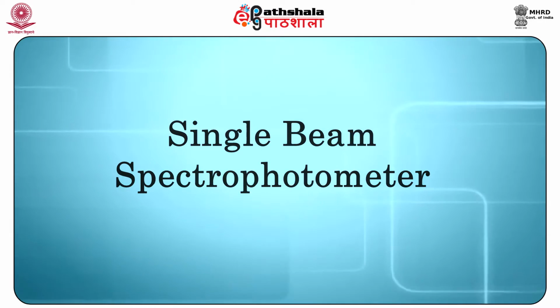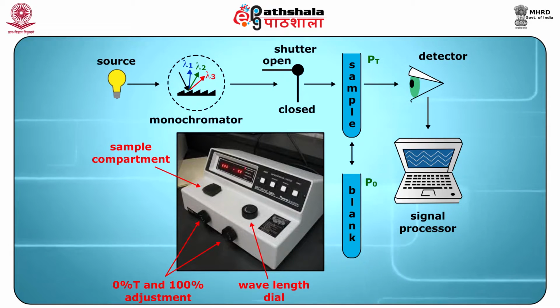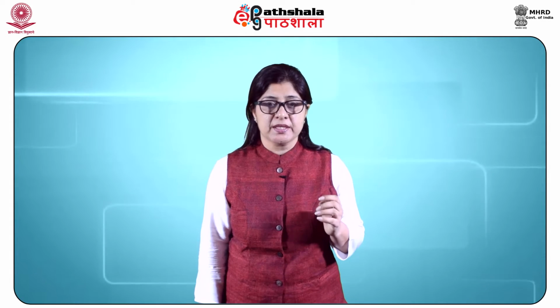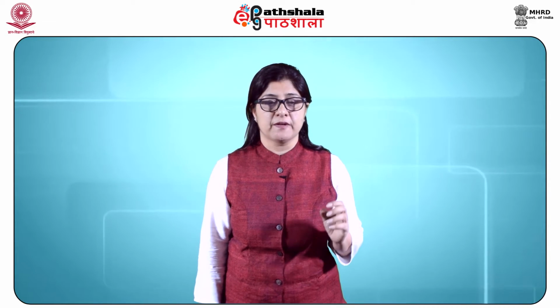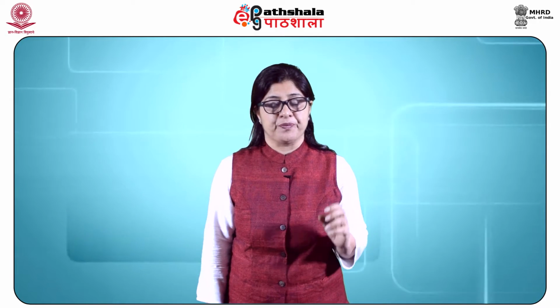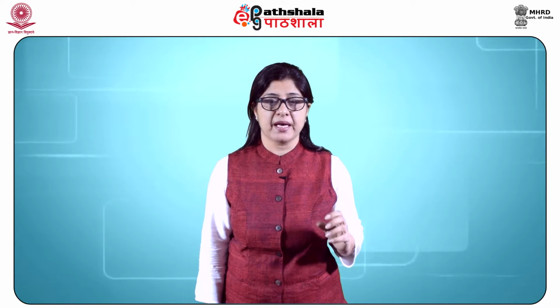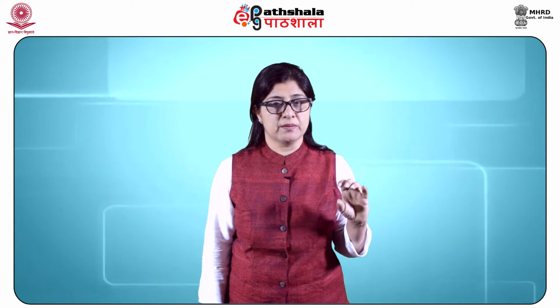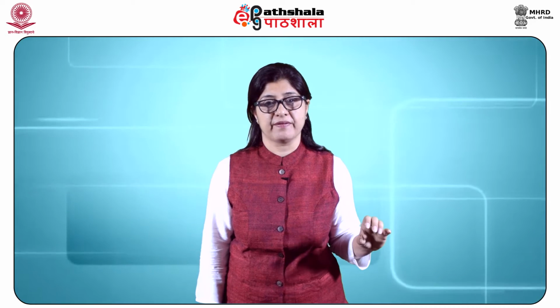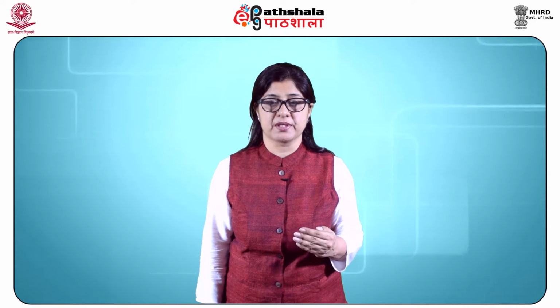Single beam spectrophotometer. A single beam spectrophotometer uses a monochromator for selection of different wavelengths. It is shown here in the figure. The simplest spectrophotometer is a single beam instrument equipped with a fixed wavelength monochromator. The calibration and use of a single beam spectrophotometer is the same as that of a filter photometer. The only difference is that it uses a monochromator to select a particular wavelength, while in the case of the filter photometer, a filter is used for this purpose.